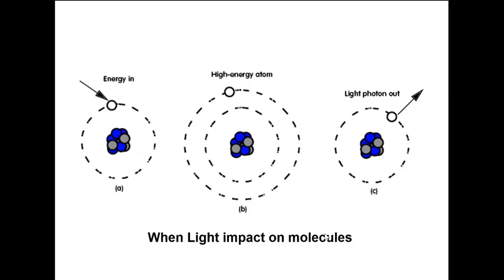No issue. So when light of definite wavelength interacts with any matter, let us take any biological molecule, the light possesses some energy. This energy is absorbed by the particular biomolecule of interest. The valence electron absorbs some light energy and is moved to a higher energy level.